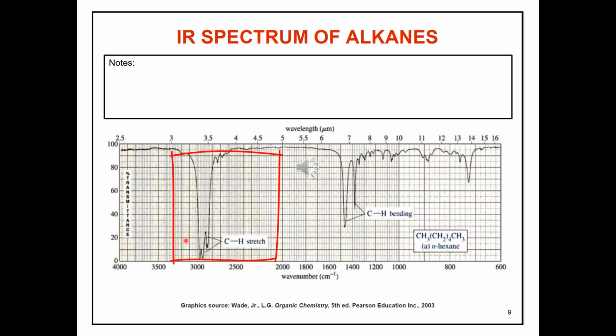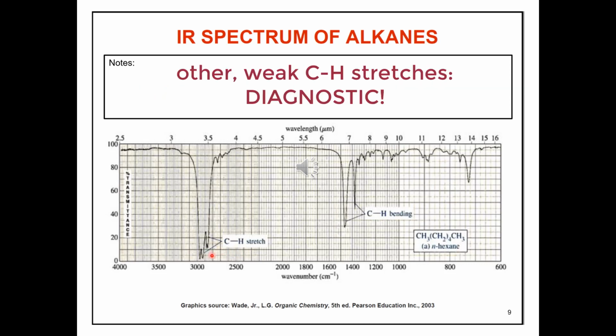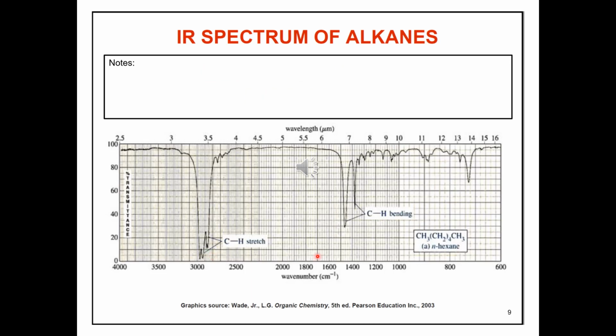numbers. Now, since most organic molecules will contain these bands, an organic molecule with this in its spectrum is not diagnostic. In fact, if you see other carbon-hydrogen bond stretches, then that's when you should cite them, because they're indicative of other functional groups. And as usual, please don't cite any of the bond vibrations in the fingerprint region.